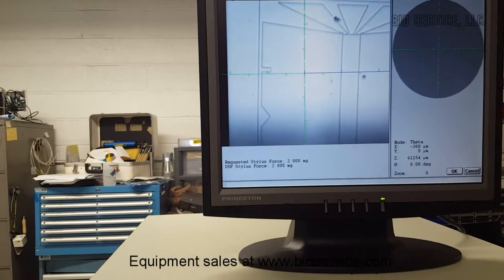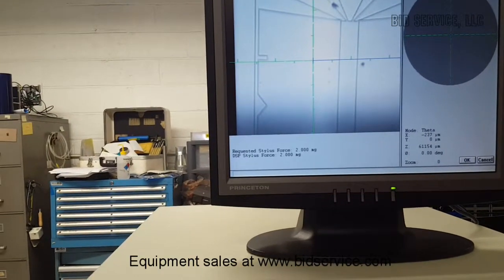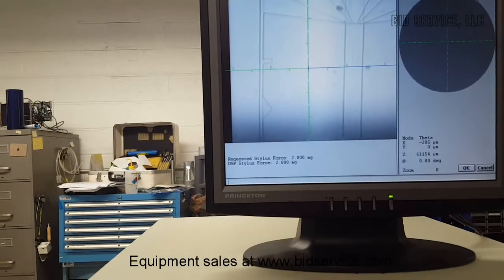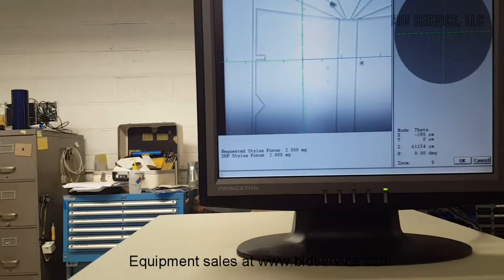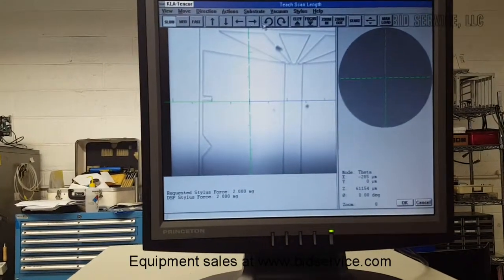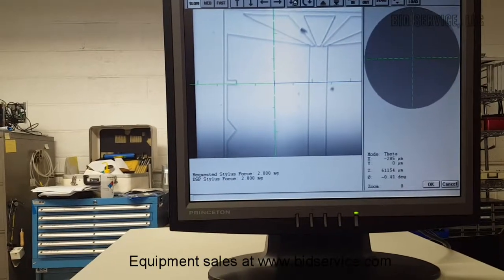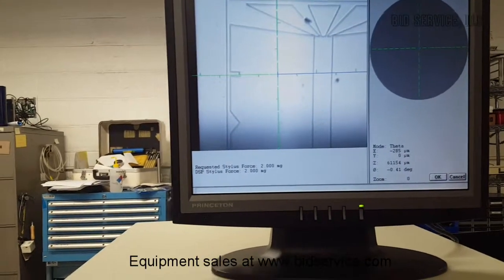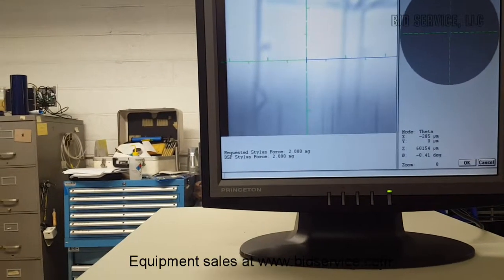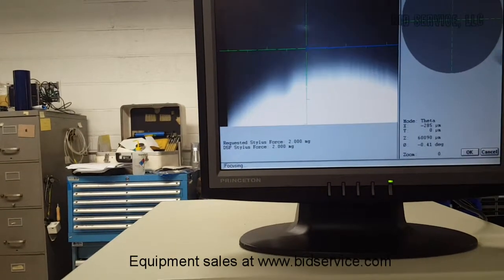If you select slow speed, then you can click the left button on the mouse, and you can see the stage moving at a very slow speed. At the end, when releasing the button, the stage settles down, which is normal. Also there is a theta, with which you can rotate the sample along a vertical axis. And this is elevator up. You just click a button, and it moves up.